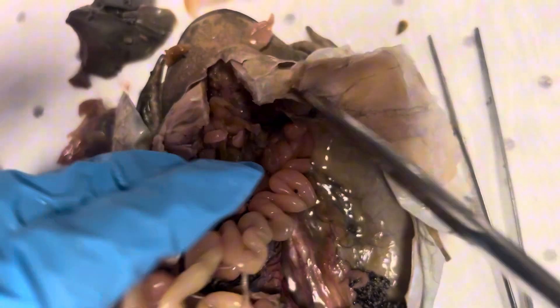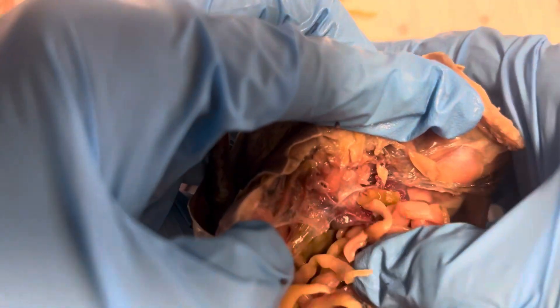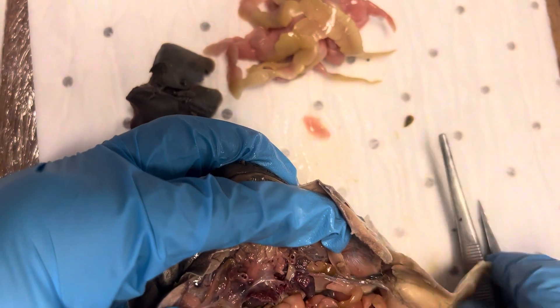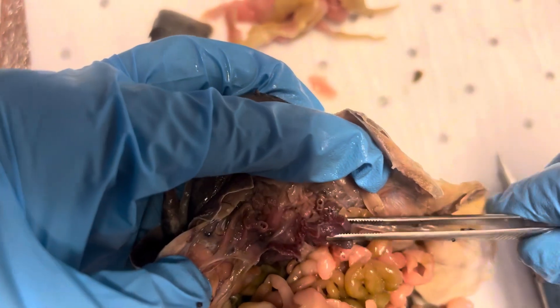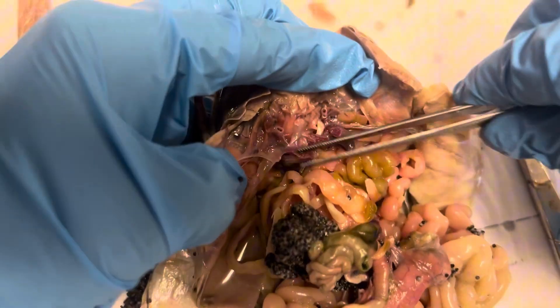The lungs are actually quite interesting as well — we can find those. Yeah, there they are. Unfortunately I've cut through them, but those are the lungs there — that's one, that's the other. I think I've taken them out a bit with the heart.